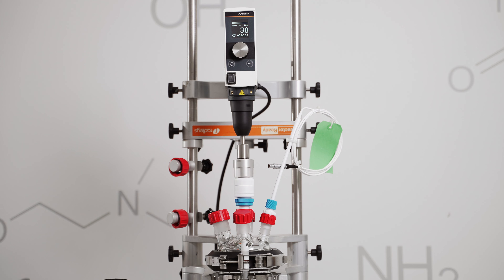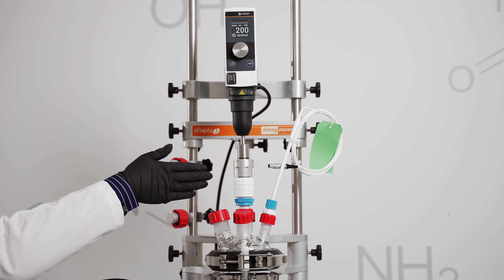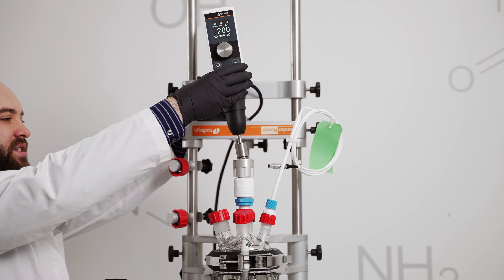When rotation begins, the drop-in coupling self-aligns itself, even in cases of major misalignment.